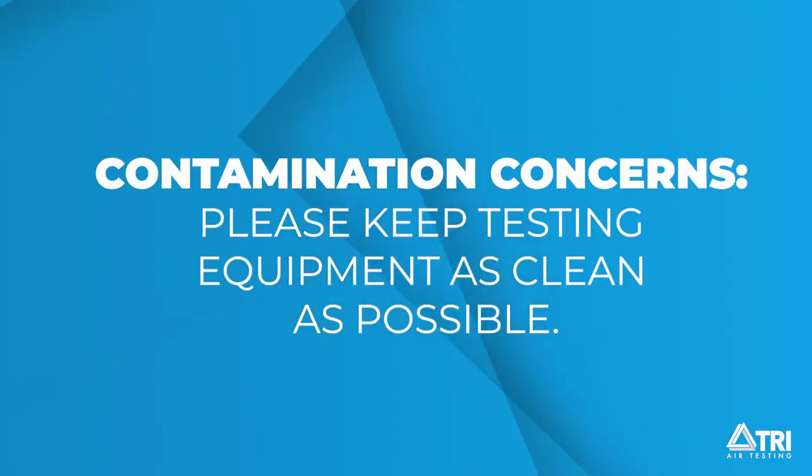Before we begin, there are some special contamination concerns. Mold and bacteria contaminants exist everywhere in our environment unless specifically excluded.